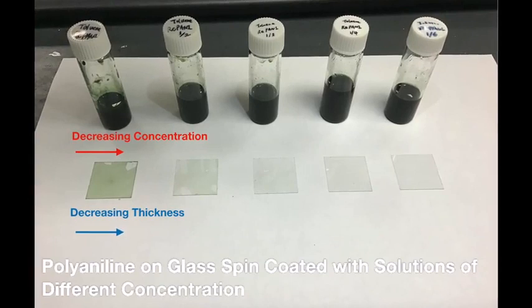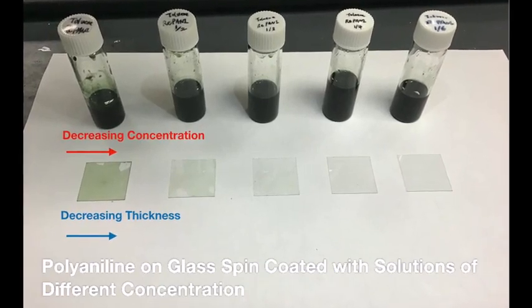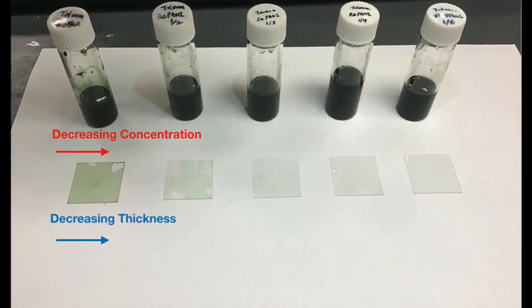We can control the thickness of films by changing the concentration of polyaniline solutions in spin coating.